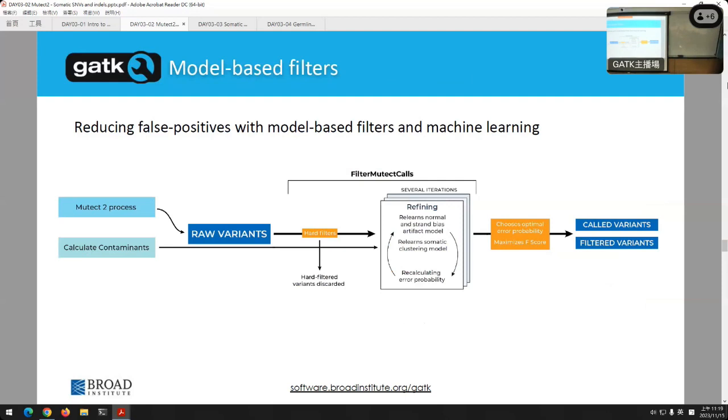Any questions, though? I'm describing a general sort of, this is how a lot of optimization loops work in algorithms, but I don't know how many of you have a computer science background. This is that loop where you go over and you change a model, you say, is it better? You change it again, is it better? Is it worse? And eventually you stabilize and say, there are no more obvious changes to make it better. That last machine learning refinement step is how we really zero in and gain a lot of confidence in our total set of calls. I will pause though. Are there any questions?